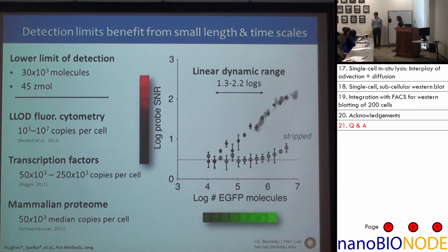Sure. So the question here, regarding the time, how long does it take for detection? Yes, for the workflow. How long does the assay take? I apologize, I omitted that. So this particular single cell assay, the workflow that we're using is about 4 hours. And most of that is actually incubation with antibody. So that antibody incubation step for the immunoassay is to make sure that you reach equilibrium. We just submitted a manuscript now, looking at de-cross-linking the gel in order to get the antibody in more effectively so it doesn't partition out into the fluid phase.